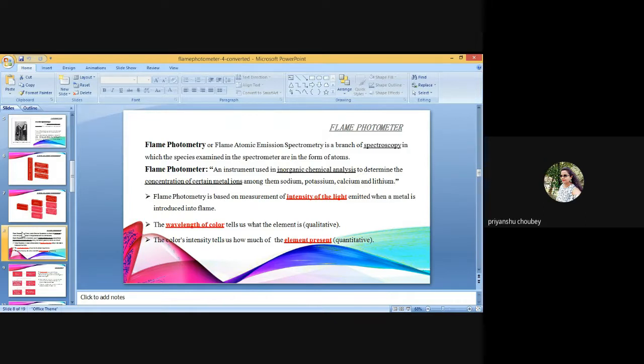Start the pump and set the baseline to zero from the keyboard on the spectrophotometer by injecting the blank. Then run the instrument for calibration and sample analysis.